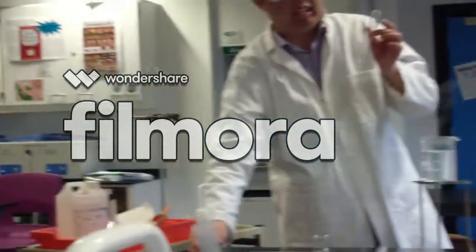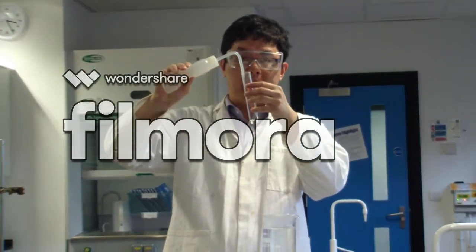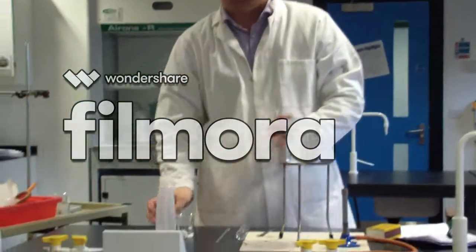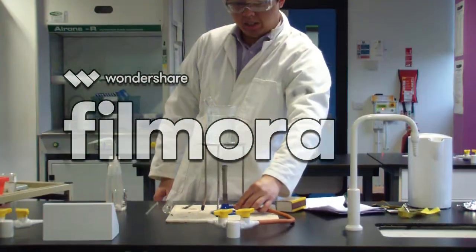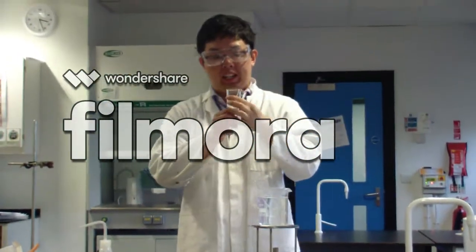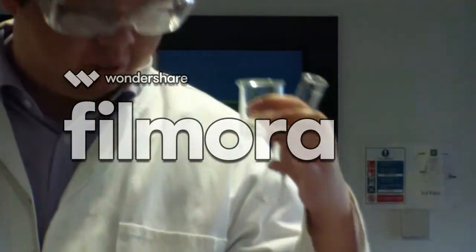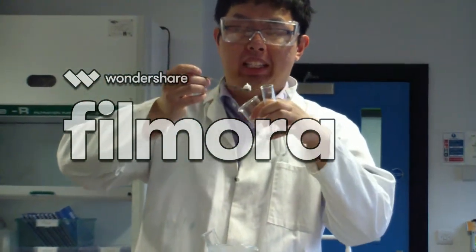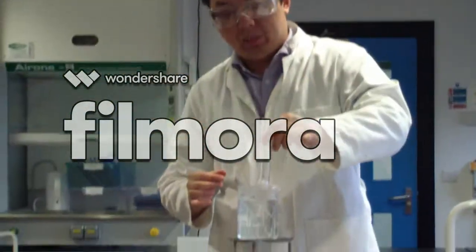And now we add some distilled water into a boiling tube. We let this boiling tube heat up, and I can transfer little bits of it into the boiling tube containing my benzoic acid. Now, here's my impure benzoic acid that I made earlier. You transfer most of it into the boiling tube, but you keep a little bit for your TLC later on. Benzoic acid is inside this boiling tube, and I will put it inside the water bath.